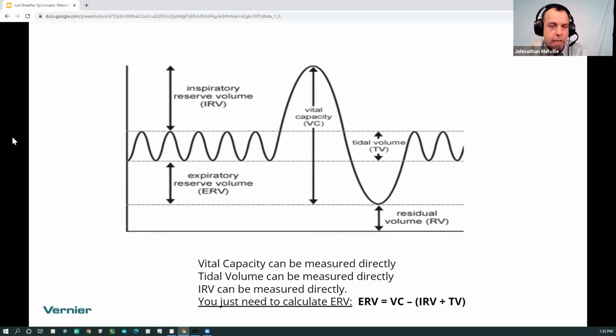What you will normally see is that first recovery breath that the student takes, after they've inhaled as hard as they can and exhaled as hard as they can, will typically be larger than the standard tidal volume, and then it will begin to get more normal. There's nothing to say that you can't do more breaths for this activity. You could increase the duration of the experiment and have them do like 10 normal breaths, and then one big inhalation and one big exhalation, and then 10 normal breaths. So you could still look at tidal volume.